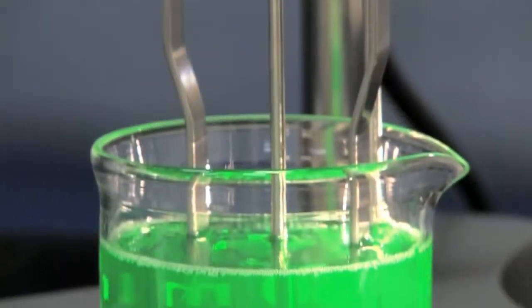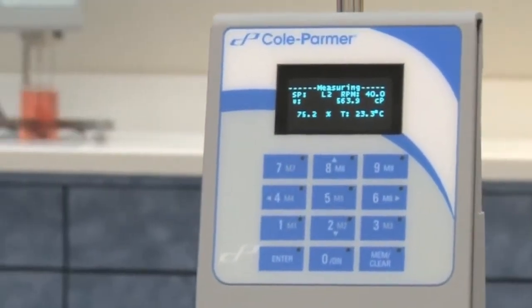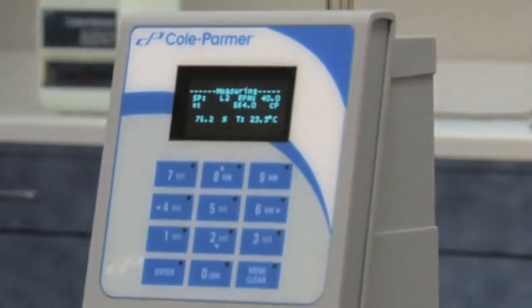This rugged instrument is designed with 316 stainless steel spindles, a sealed keypad, and over-under range alarms to provide more accurate and dependable results.